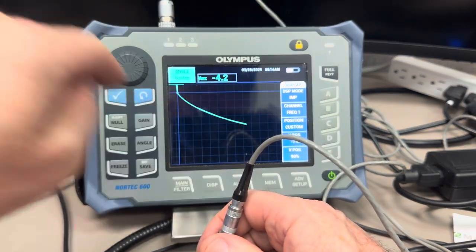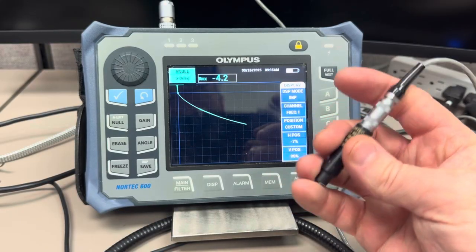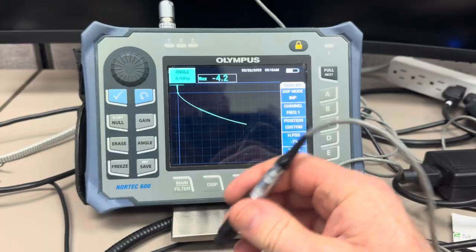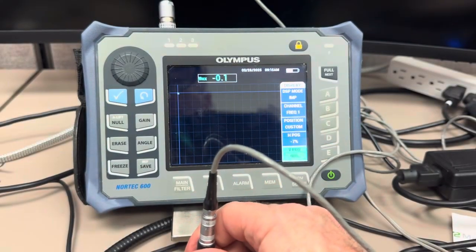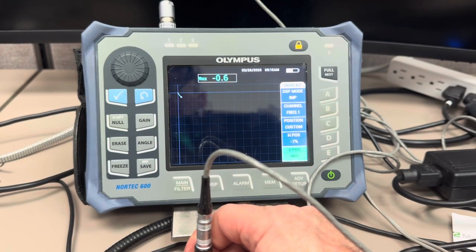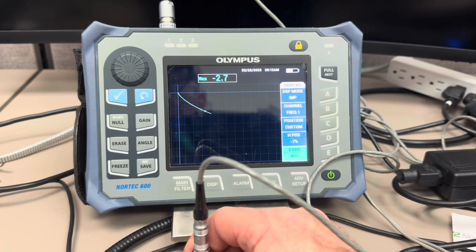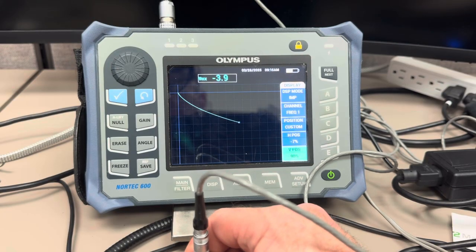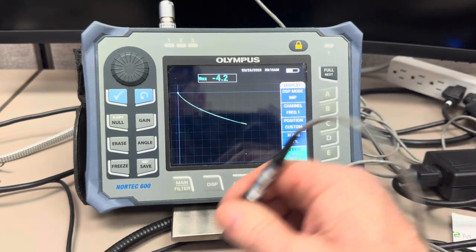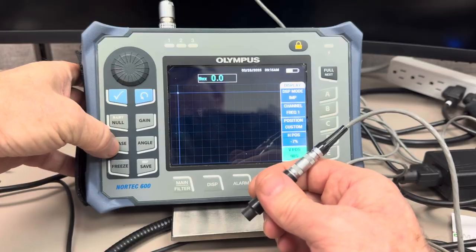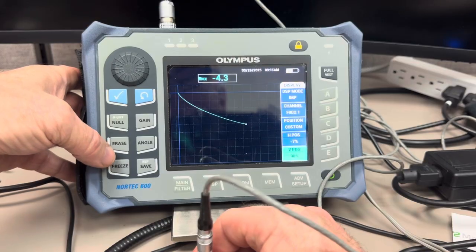So over here with the unloaded coil that has high inductive reactance and low resistance because there's not anything sucking energy away from this coil. But when you bring it slowly down and you reduce liftoff. You're reducing liftoff and you're bringing it down to the 304 stainless. Your inductive reactance is going down because you're loading the coil. And your impedance value keeps increasing because the apparent resistance is going up because that material is sucking energy away from the coil. All right. That's 304 stainless. That's your liftoff line. That's 100% liftoff. That's a little bit of liftoff. And that's zero liftoff or contact.